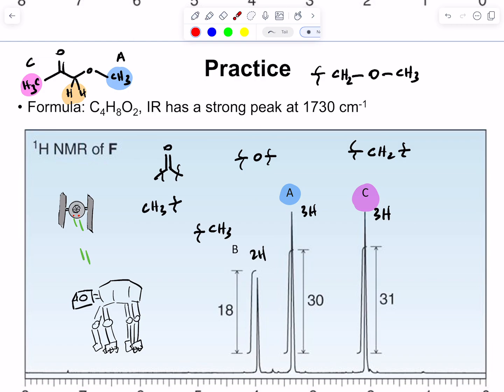It's between two things, right? It's between the oxygen and the carbonyl. The de-shielding impact of being adjacent to oxygens or adjacent to carbonyls is somewhat additive. So these orange protons are de-shielded to some extent by being adjacent to an oxygen, and then a little bit more by being adjacent to a carbonyl. Okay, this is the right structure.